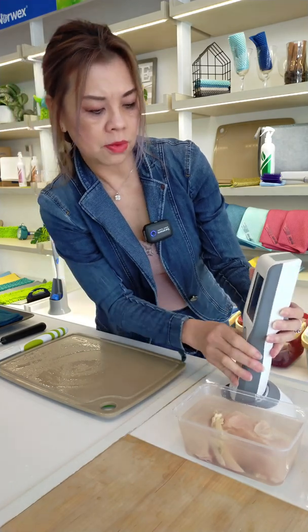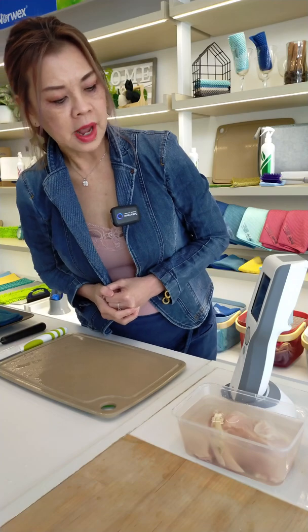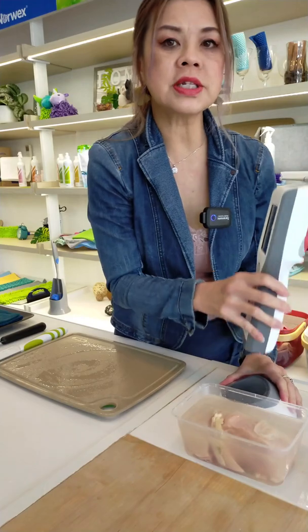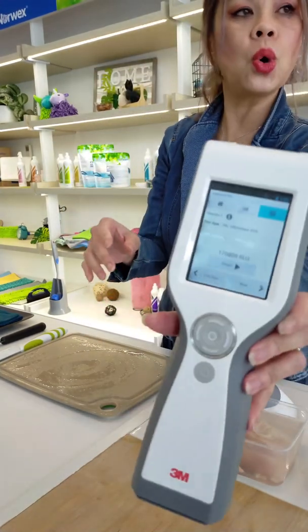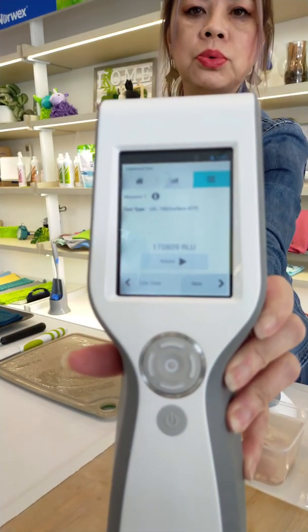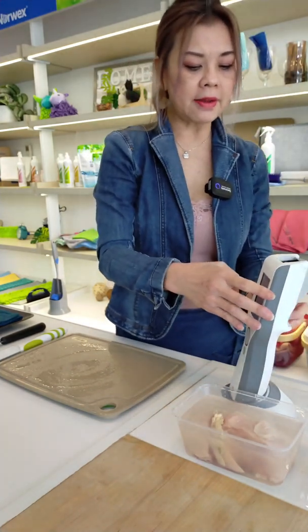And start. Let's see how much this is after one cut of a chicken. Because it's an immediate fresh cut, it actually registered 170,809 RLU. That is from the stainless steel knife.